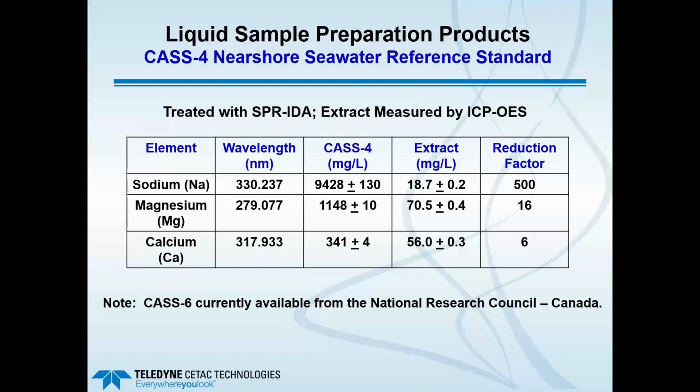I do want to point out, for seawaters, a lot of these are available from the NRC in Canada. CAS6 is the currently available form. There are other seawaters also available that you can access that are certified for verifying your sample preparation methods and techniques.